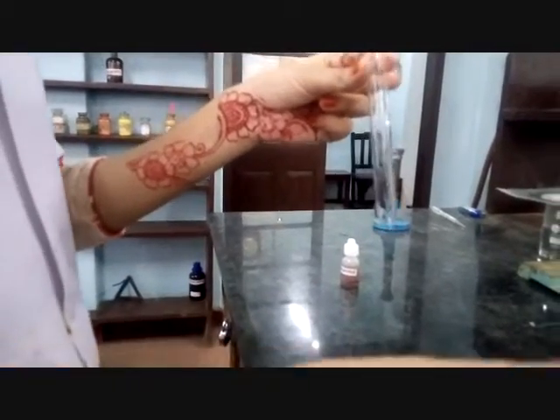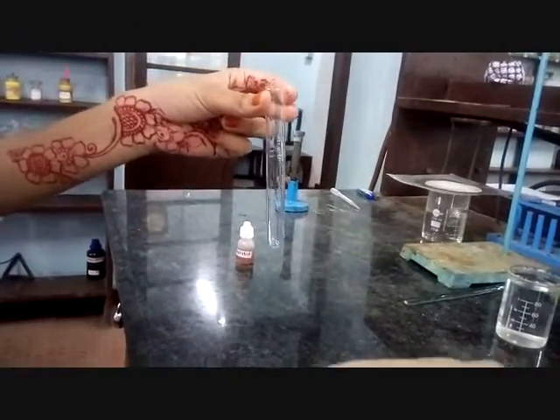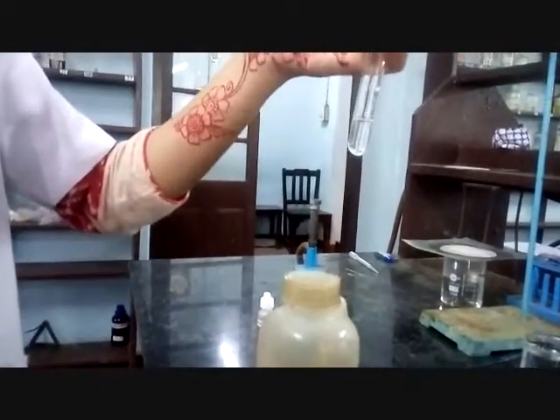Molisch's test. To an aqueous solution of the compound, add 1 to 2 drops of 1% alcoholic alpha-naphthol.